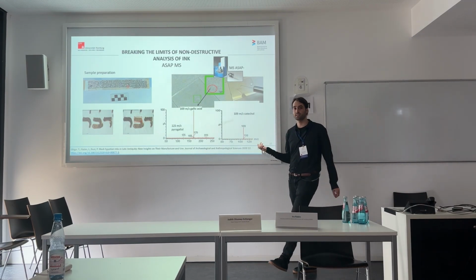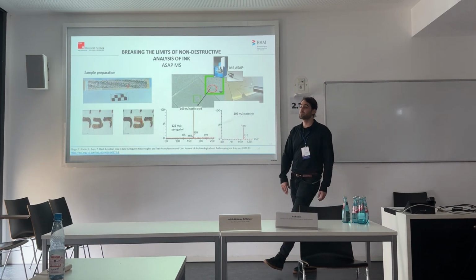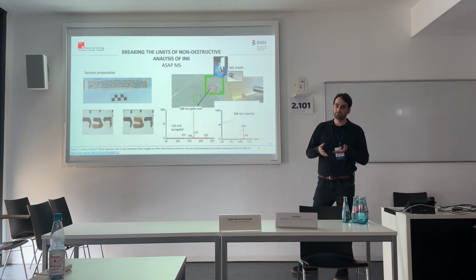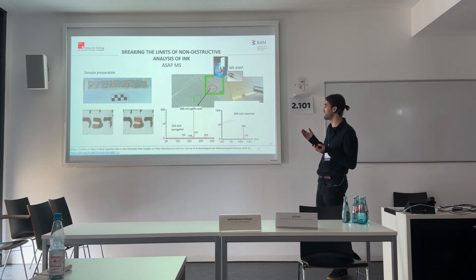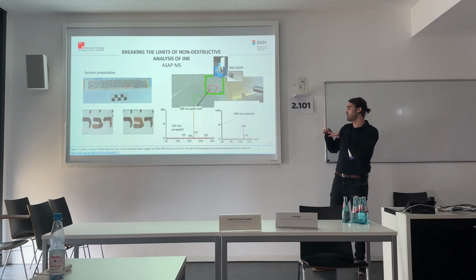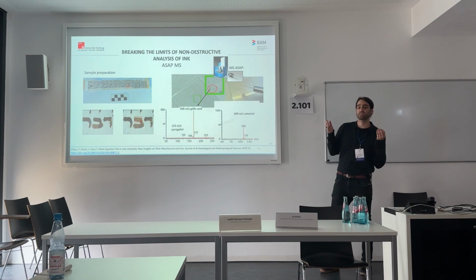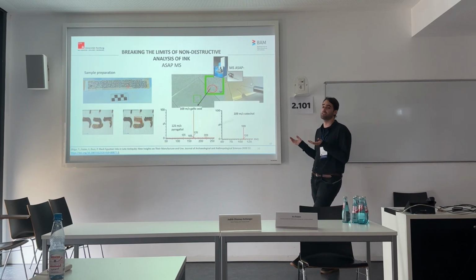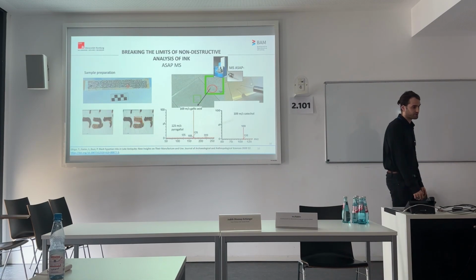On the other hand, in some other instances of inks and our mock-up samples, in cases of condensed tannins, which are very generously present in the tree bark, for instance, a very common source of tannins for inks, we see catechol or other derivatives of condensed tannins. We can, using this method, differentiate among those two types of inks. Unfortunately, we cannot say what exactly tannins were introduced, as tannins degrade rapidly. And we only see small fragments of those big molecules which were initially introduced there.